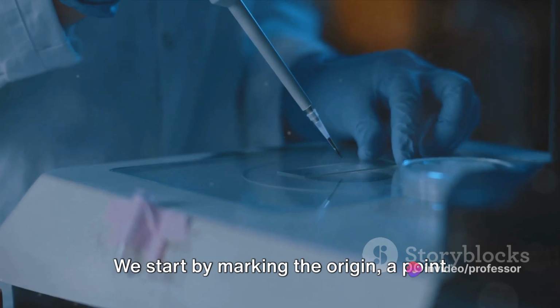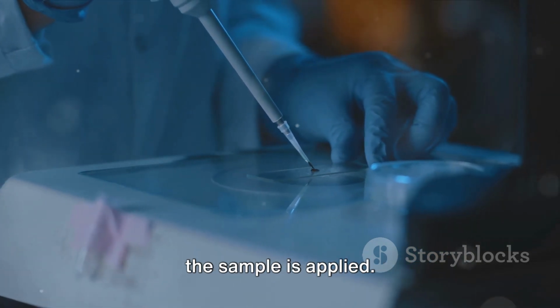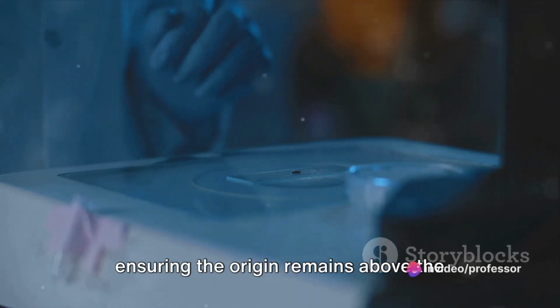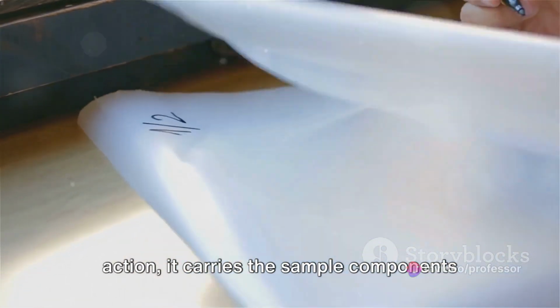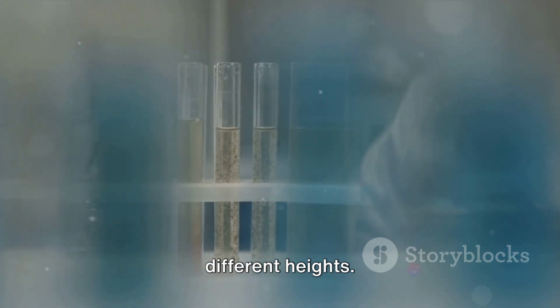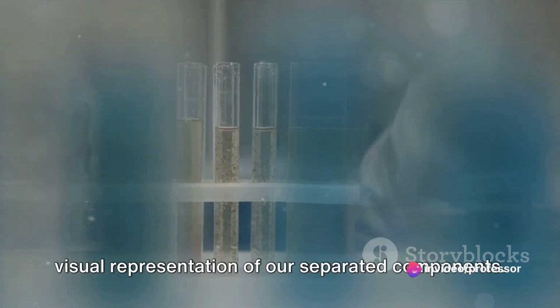We start by marking the origin, a point near the bottom of our paper strip where the sample is applied. The strip is then placed in a solvent, ensuring the origin remains above the solvent level. As the solvent rises through capillary action, it carries the sample components upwards, each at a different rate, resulting in a series of spots at different heights. This is the resulting chromatogram, a visual representation of our separated components.